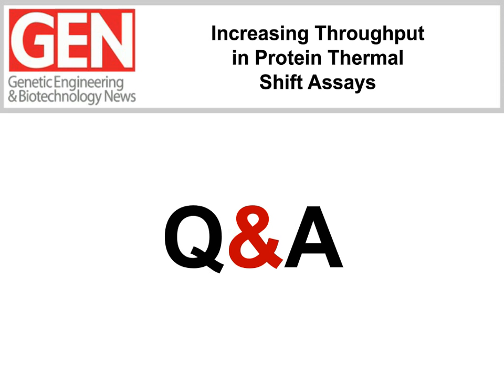And minimum volume, I mean, you can go down to 1 microliter and 1.5 microliter. The detector is capable of seeing those fluorescence events as well. But again, you are actually playing at the level of ability of providing fluorescence information to the detector. And most of our standardized experimentation, especially for qPCR, as well as for the protein melt assays that we have performed, we have done it at 2 microliters.